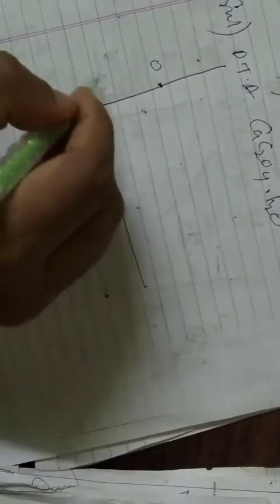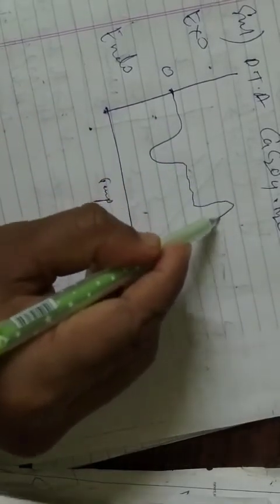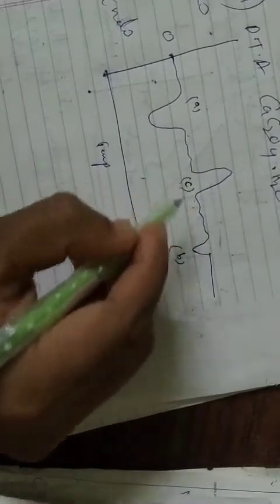So on the XY recorder, you take temperature, and here we will start from 0. Downward, you know that it is endothermic, and upward we know that it is exothermic, and you will get something like this, okay. So I will name this A, this B, and this C. This is how we are going to get it here.